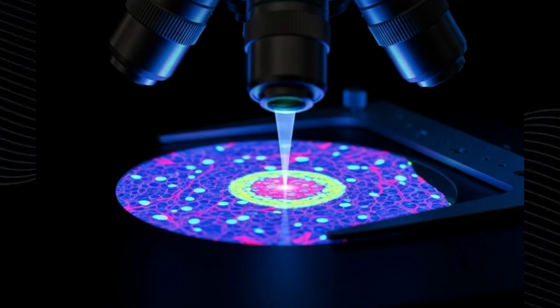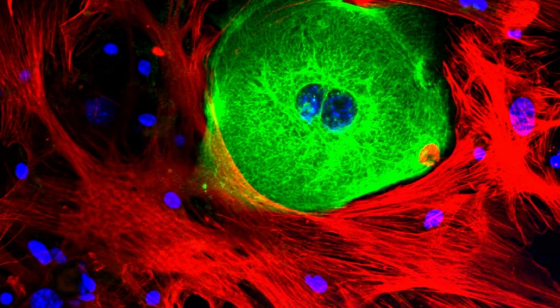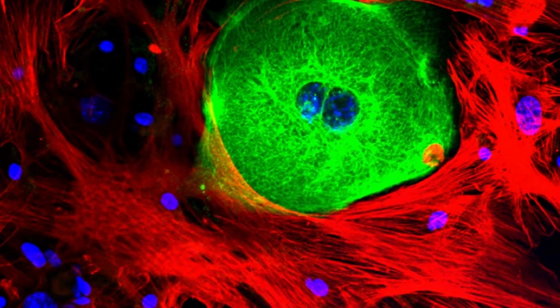One of the greatest advantages of fluorescence microscopy is that it allows scientists to visualize specific parts of a cell instead of the entire cell. This is achieved by using different fluorochromes or fluorescent antibodies that bind only to particular cellular structures.